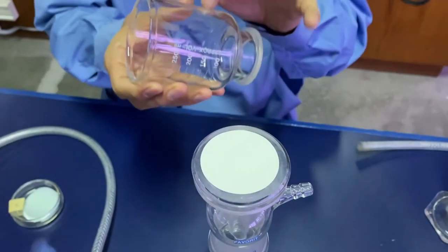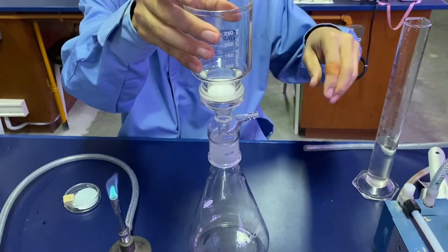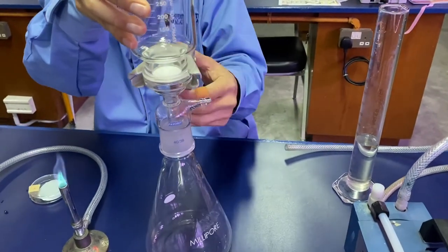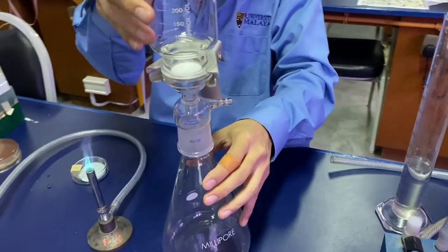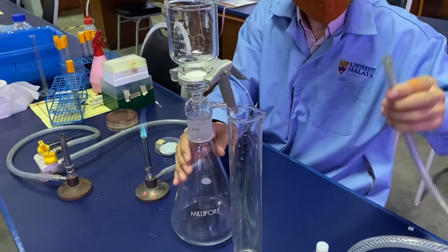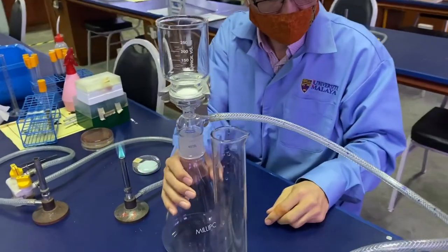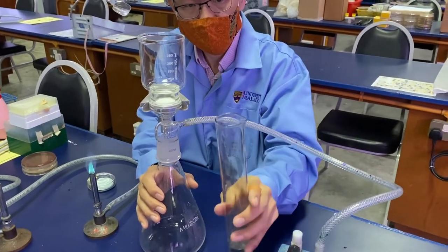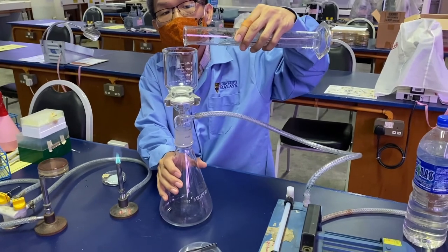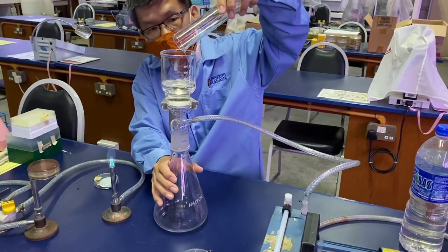Place the funnel gently onto the membrane filter and onto the base, then clamp it so that it will not fall down. Attach the vacuum pump, and then pour the sample into the funnel.